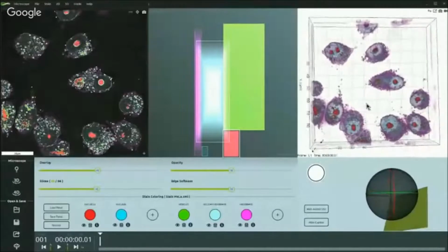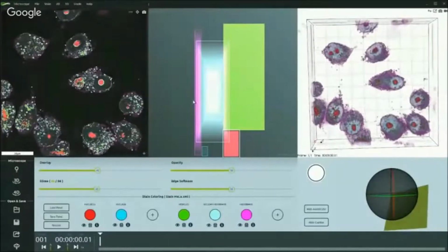Okay. Now, before playing more with those images, let me tell you something more about this stain. This stain, the refractive index, is very different from fluorescence. Fluorescence is always expressed in arbitrary units. The refractive index is not arbitrary, okay? Once you have defined your stain, this stain will apply every time.